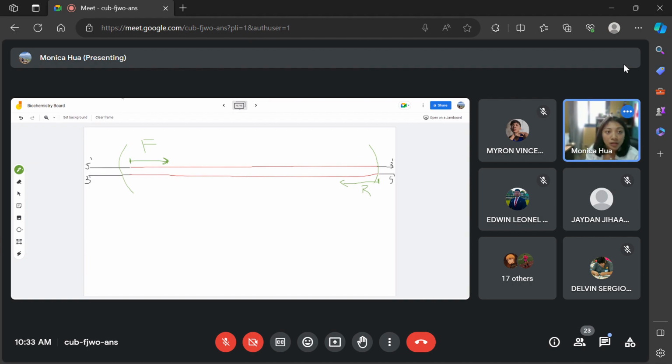Now, on this forward and reverse primer, you can design an additional sequence. Of course, the forward primer will have to have ATG, and the reverse one has to have a stop codon, maybe like TAA or something. There are 3 you could choose from.